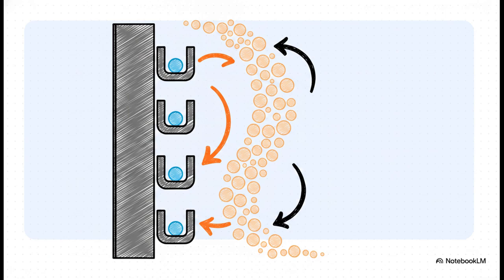To break down this chemistry into a simpler analogy, just imagine this stationary phase inside the column as a set of very sticky chairs. The ions in our sample want to sit in those chairs, but the ions from the mobile phase want those exact same seats.